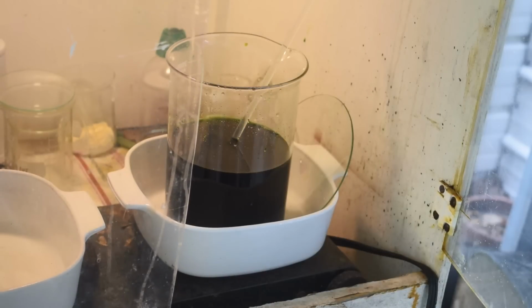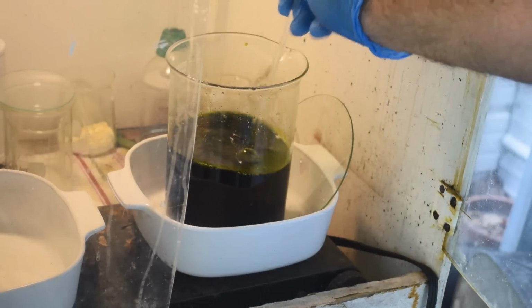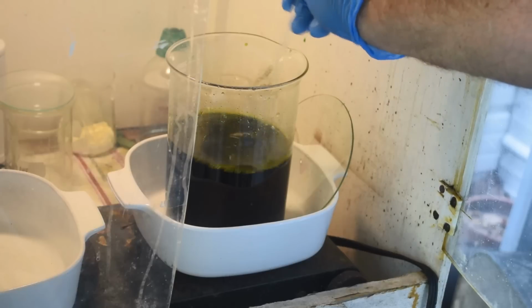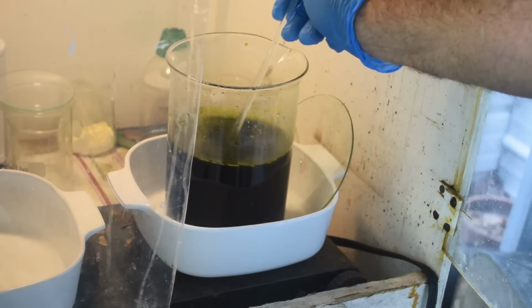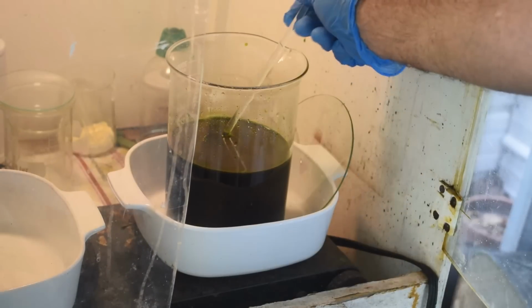Okay, here we go with another liter of the liquid. We'll see if the reaction is energetic or kind of blah this time. I got a feeling they're all going to be kind of blah from here on out because this liquid's a little less concentrated. There's been some rinse water that's gone into it. And I had some liquid that was less concentrated to begin with, too.